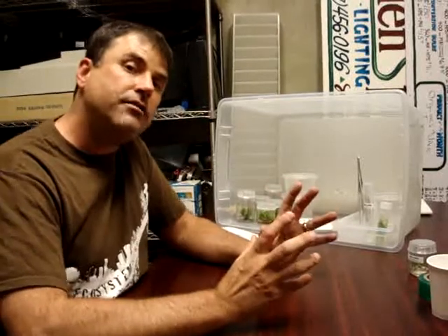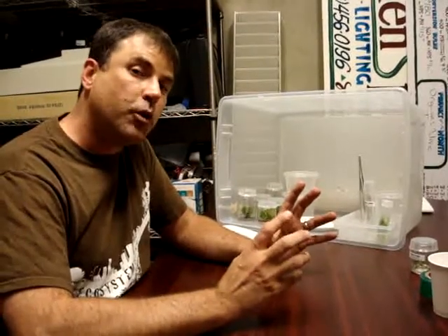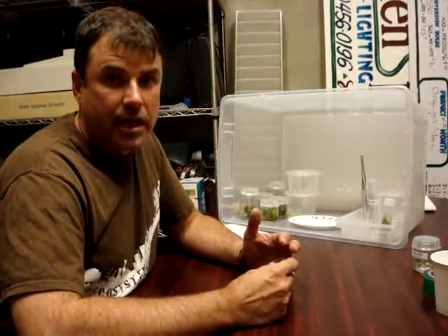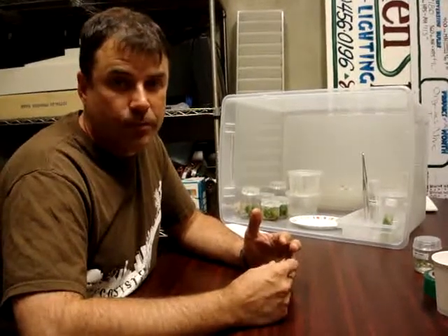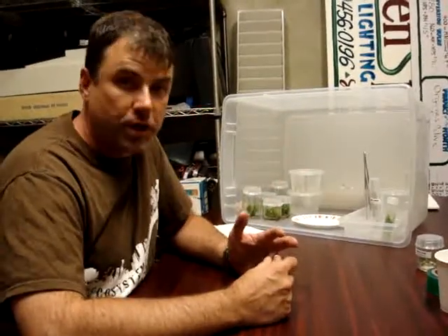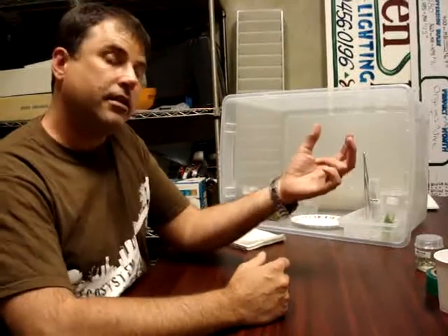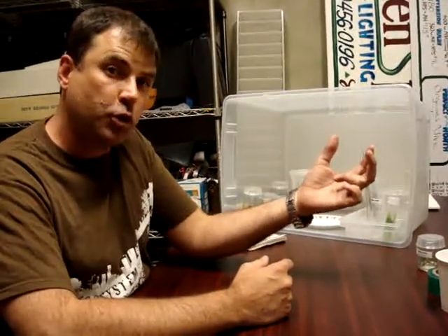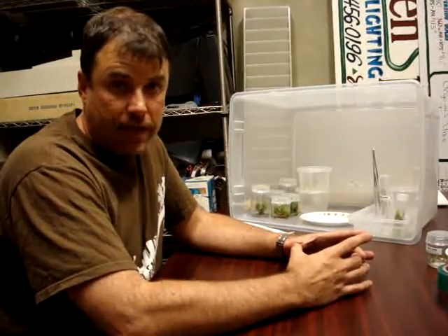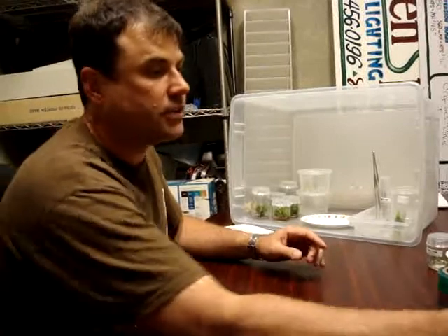We're going to have two kinds of jars that the plants will be growing in. The first one is a multiplication jar with a multiplying or branching hormone — we're just going to take a few plants and multiply them into many. The second set is the rooting jars, where we take the extra plants from the multiplying stage, separate them, and grow them up tall and put roots on them.